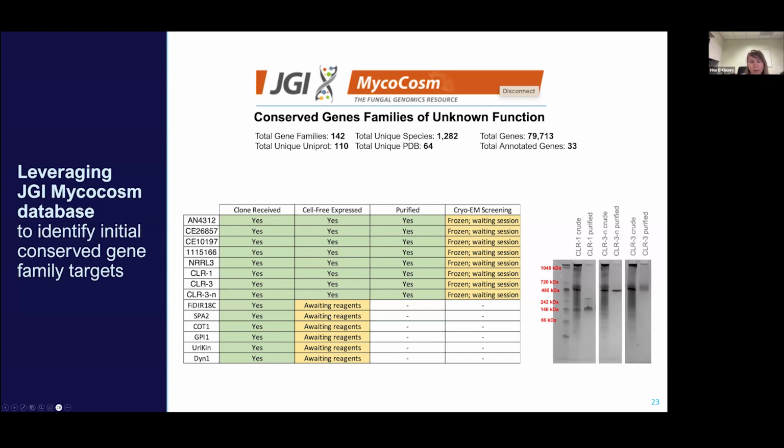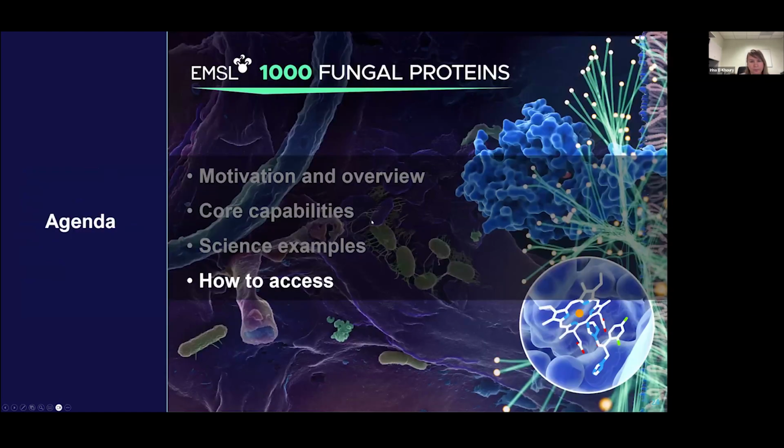This graphic is a little bit outdated. Half of them are already purified and frozen and are being queued into the cryo-EM screening session for imaging. We are very excited about the prospect of being able to fill in some gaps in this knowledge, as well as expanding our collaboration with JGI to tackle additional families.